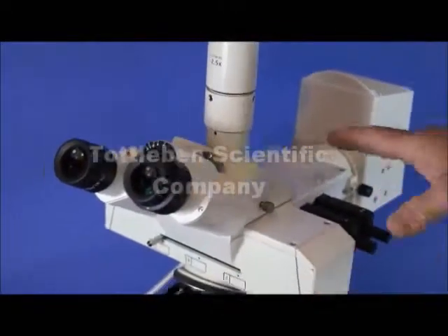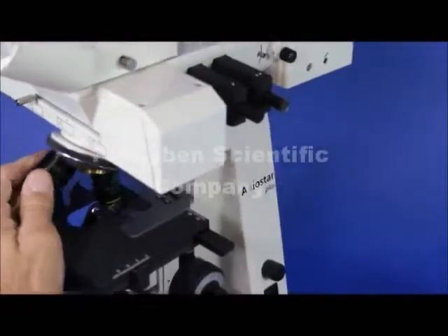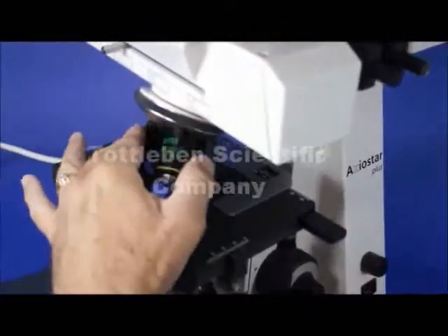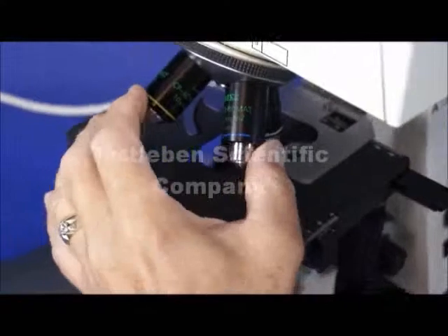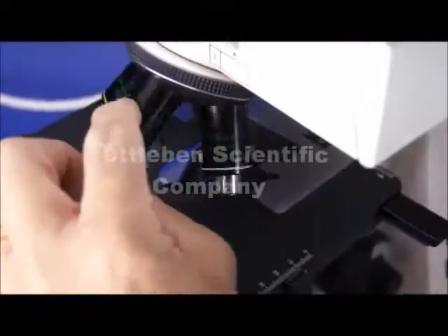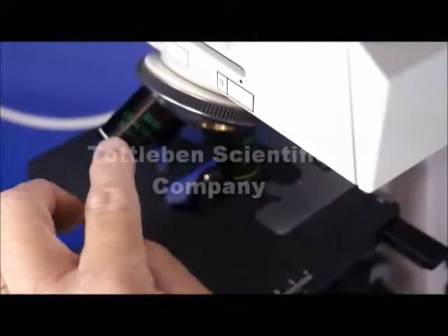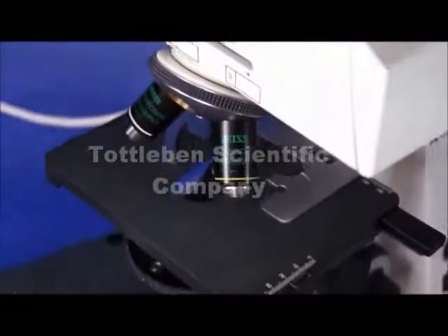Moving down the line, we have the nosepiece, which is a four place nosepiece. It is equipped with phase objectives — all of these are phase objectives. It's a C plan acromat on each one of these lenses: 10X, 40X, and 100X oil. There's a blank spot for an additional objective should you want to add one.